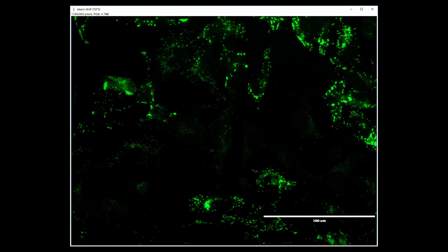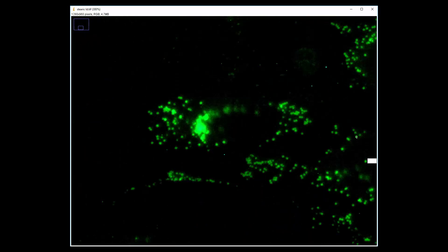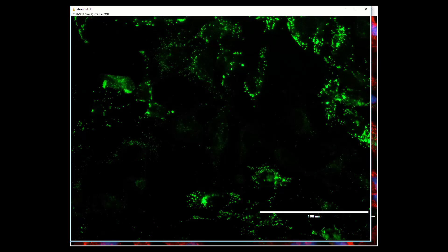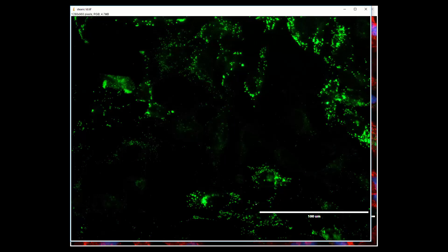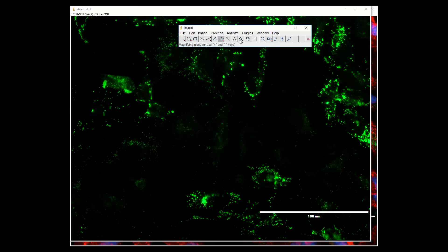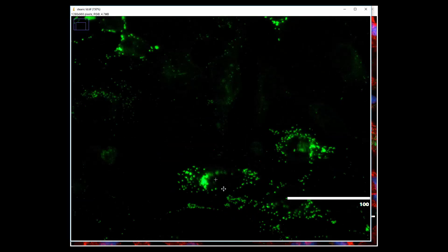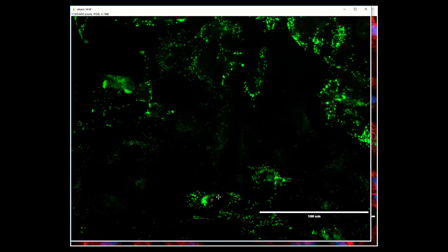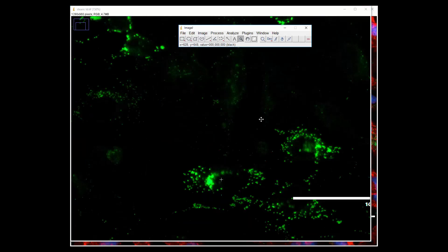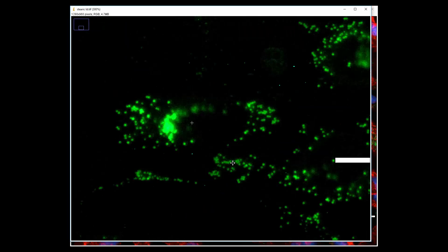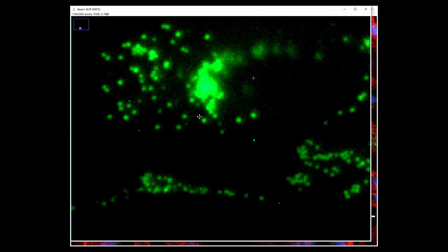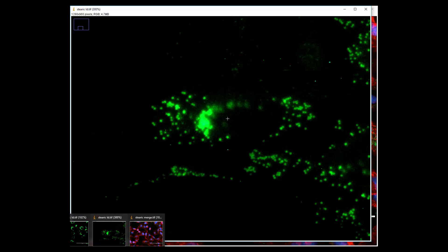Now that I'm going to count this cell first, I'm going to go to my lipid droplet sample here and count this cell first. What you want to do is zoom in on this cell. There's a couple different ways you can do that depending on your computer, but on my computer I can do Control-Plus and it's going to go where my cursor is. You can also click on it, right-click. You can set it up here, but more or less you can use this little cursor here. You can right-click and left-click reverses it. You want to zoom in enough that you're going to be able to see the individual lipid droplets. Sometimes you can zoom in too far, but then you can zoom out and get to where you think you can manipulate these images effectively.